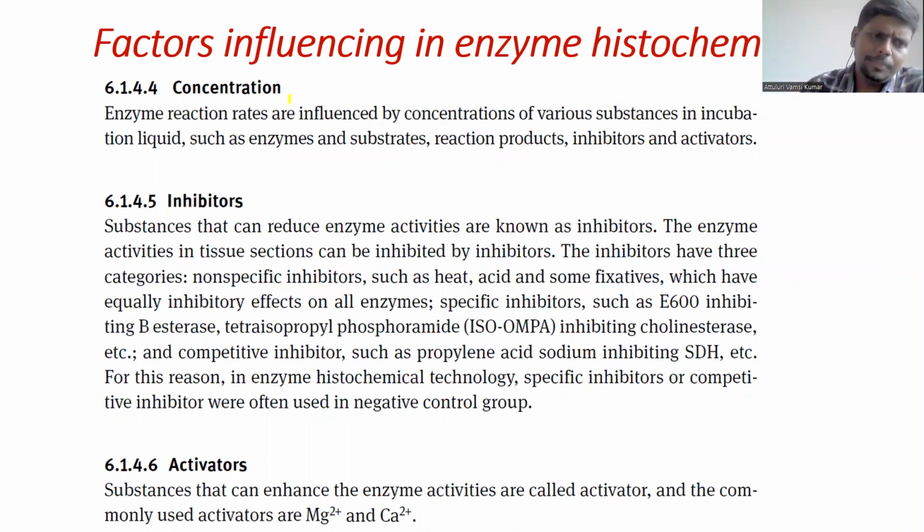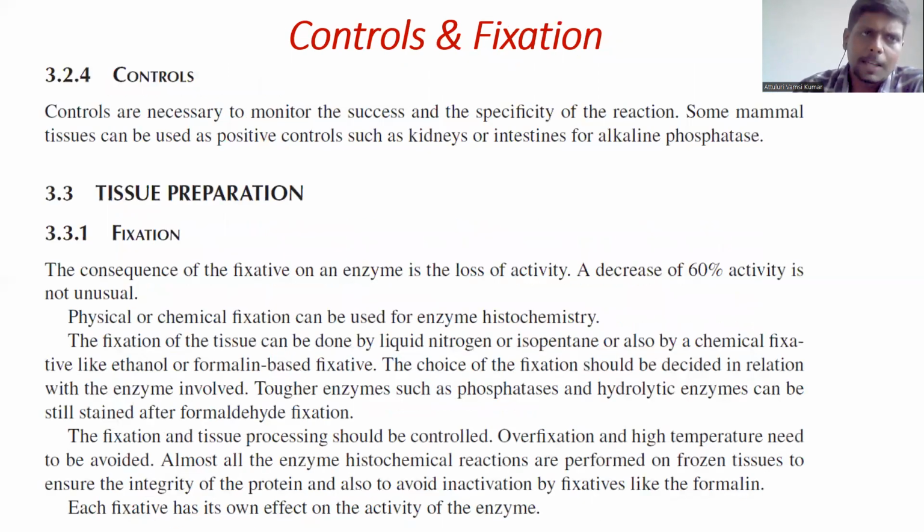All enzymes require certain cofactors, which act as activators. Sometimes even after adding substrate, enzymes cannot start working because they still depend on certain cofactors like magnesium, calcium. Only in the presence of this cofactor will an enzyme bind with the substrate. So sometimes we will add these activators also. The activators can be stated as cofactors. And controls are very important. It is because of these controls that we can validate our test results. Irrespective of any test, controls have their own significance.